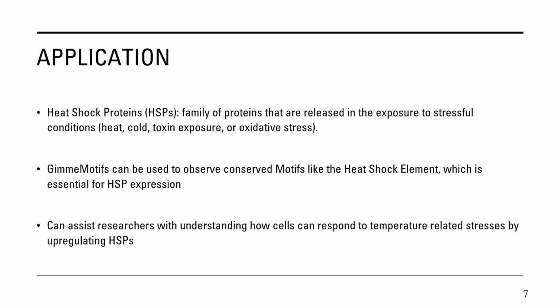And so it'll save you a lot of time during experimental research. And with this, there's also a high degree of sensitivity that comes into play, where you can detect low frequency motifs that could also have some kind of significant regulatory function in a certain stress related response. And to wrap that up, this is also a very customizable method. What I mean by this is that this method of motif finding can be adapted to different kinds of organisms, or even by looking at different stress conditions.